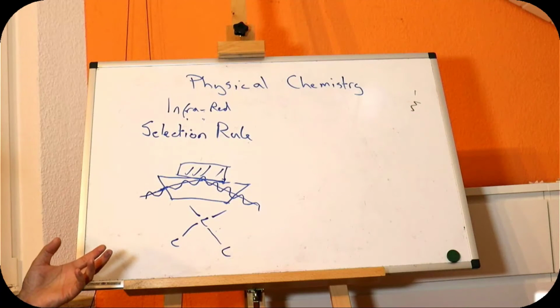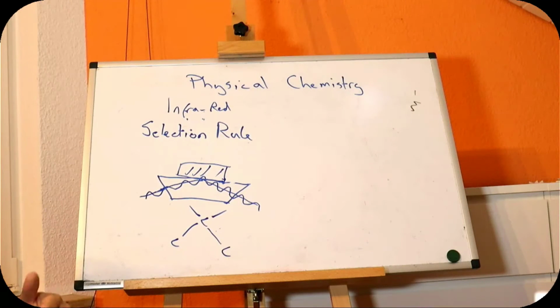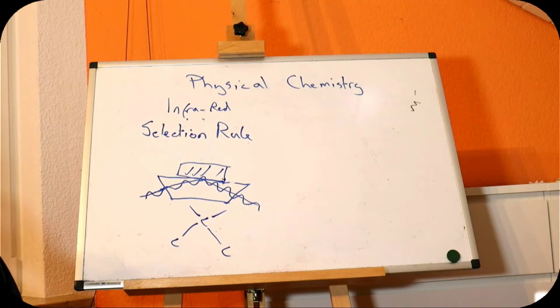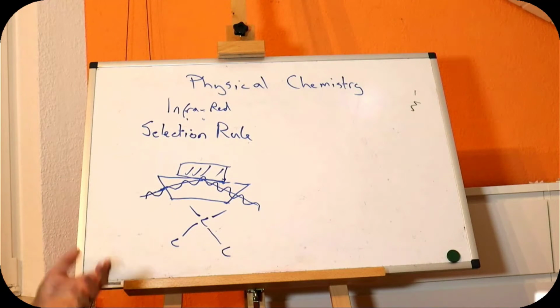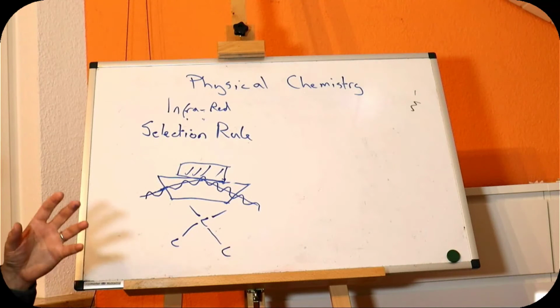It's very poor indeed. If we look at our water, because the two bonds in there are polar and it's bent, nearly everything that we do to the water involves a change in dipole moment, and that is why water absorbs a lot in infrared. The unfortunate exception to this would be our CH3 groups, which are not very polar at all. They're considered to be non-polar, but they're very slightly polarized, and they are reasonable at absorbing infrared.